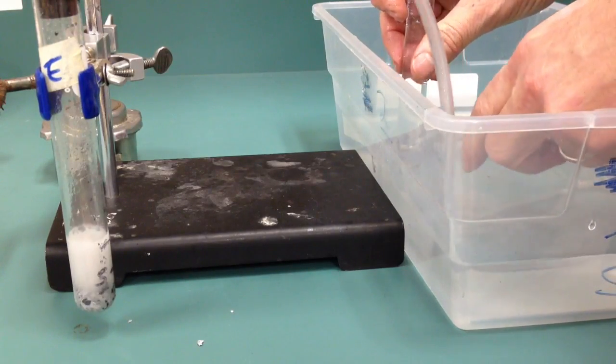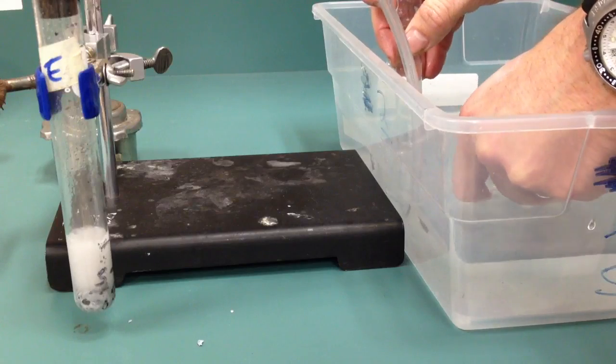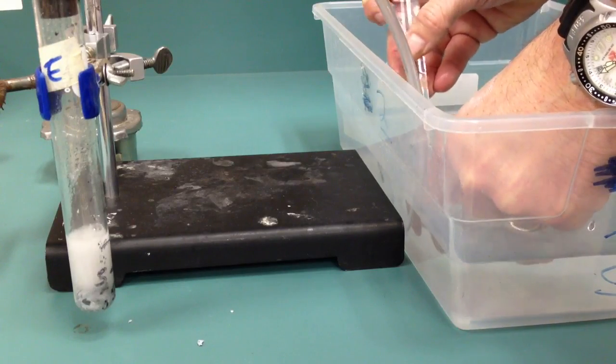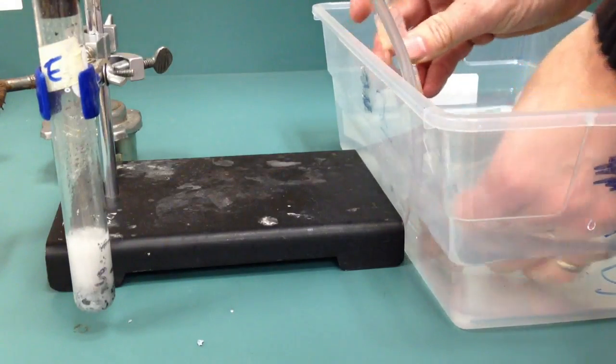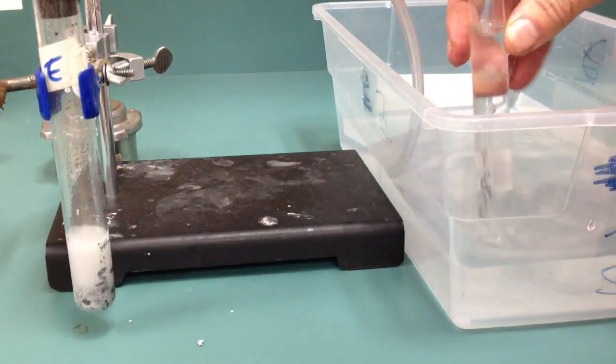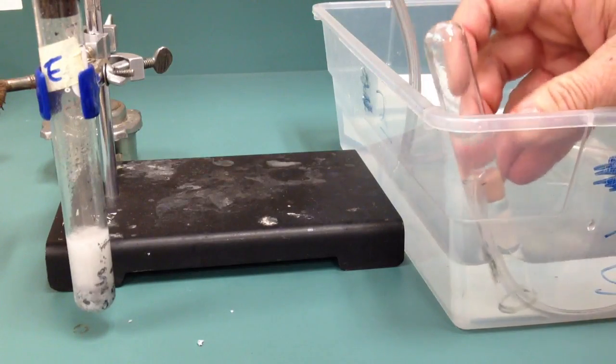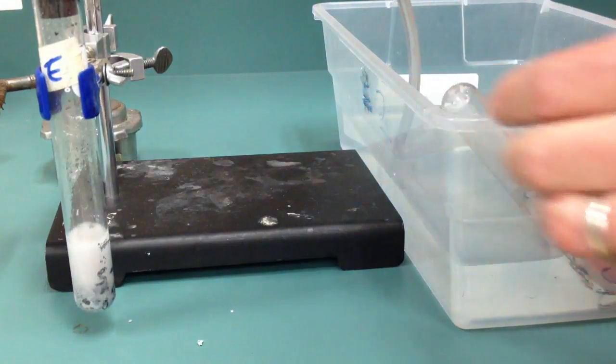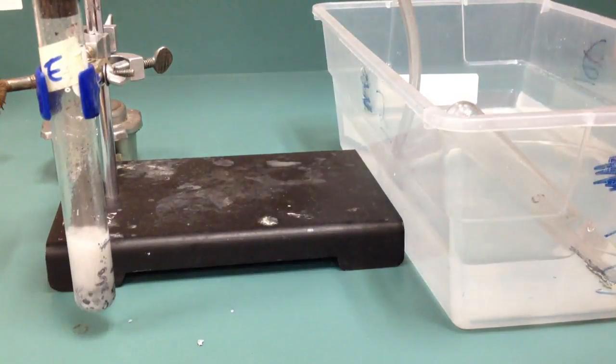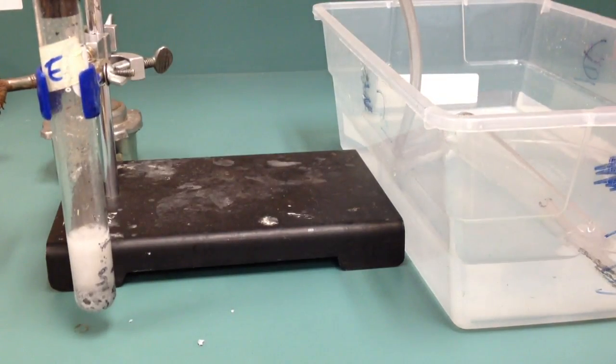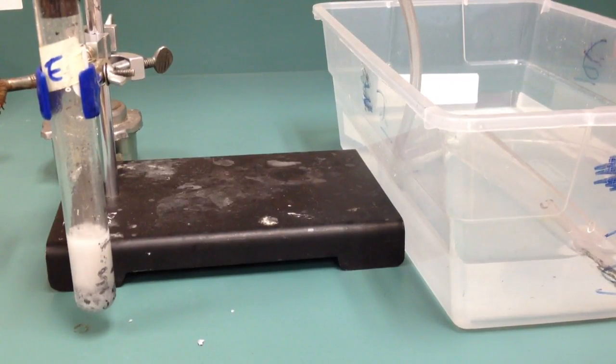Now, this is full of water right now, but you'll see as I put this in, it's going to start bubbling. And I'm going to put that in like this, and eventually, all that water is going to be displaced or pushed out of the way. Now, while that's happening, I'm going to see if I can get a lighter.